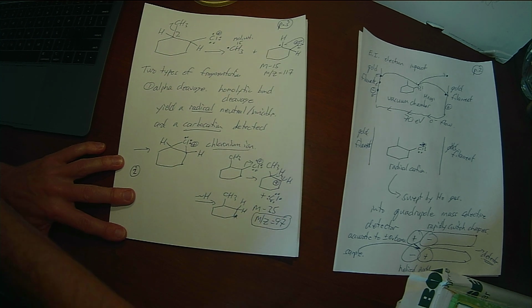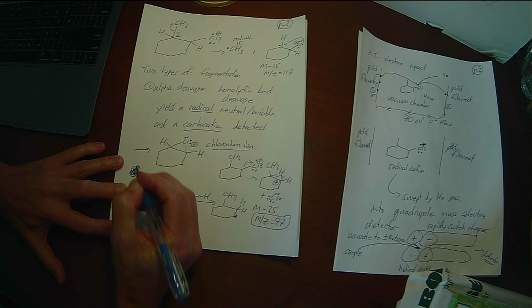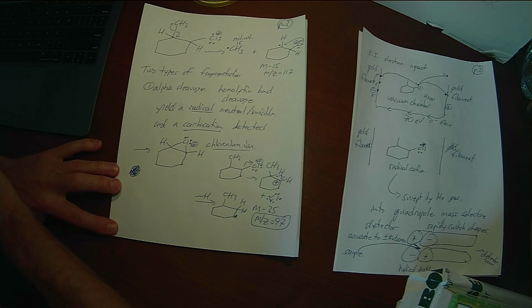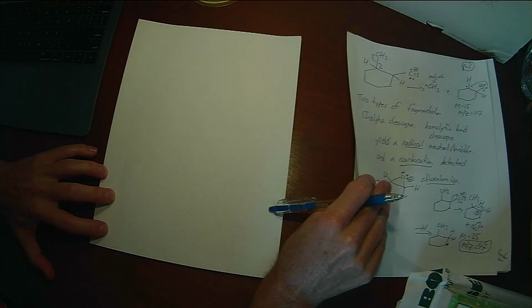So you saw that there are two peaks that had a 97 peak that was bigger than the 96 peak. Which two peaks had the 97 peak bigger than the 96 peak? There were two of the 7 molecules.